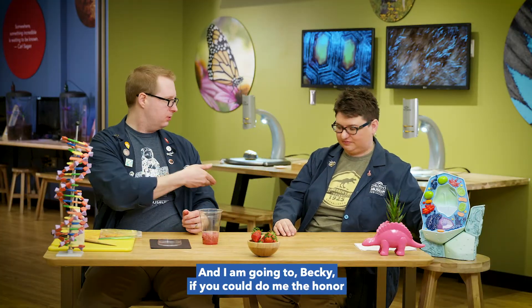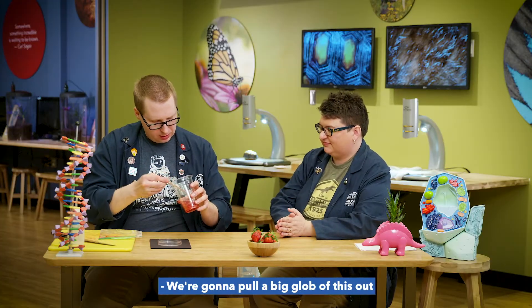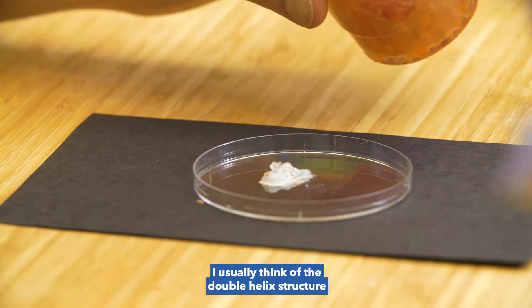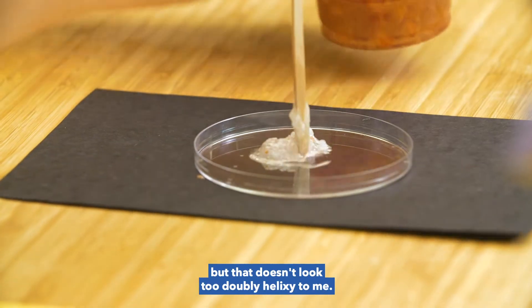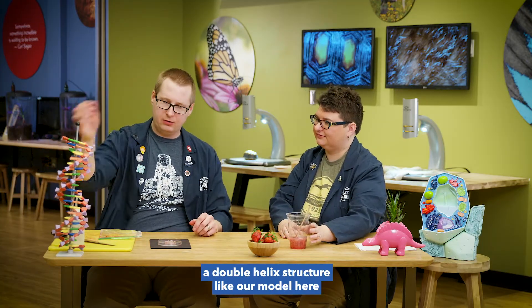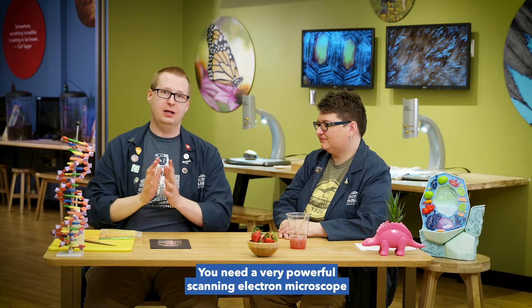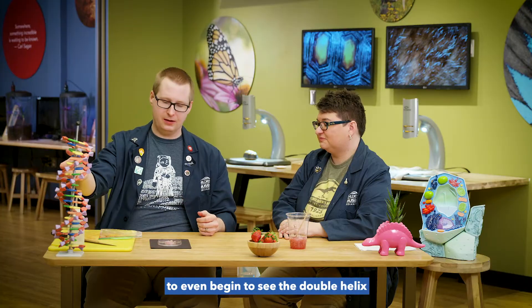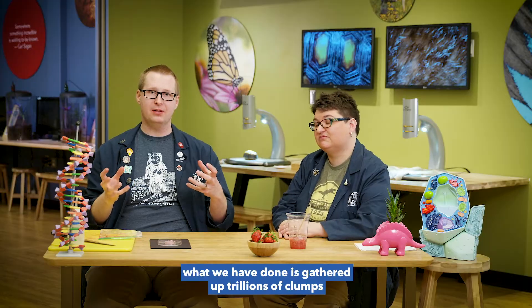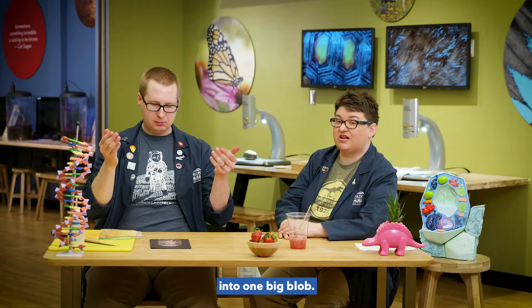We're going to pull a big glob of this out and deposit it on our Petri dish. Now when I think of DNA, I usually think of the double helix structure — but that doesn't look too double-helix-y to me. You're correct, Becky — DNA does have a double helix structure like our model here, but that's the microscopic level of DNA. You need a very powerful scanning electron microscope to even begin to see the double helix. Since we don't have one of those, what we have done is gathered up trillions of clumps of DNA, all piled and coiled on top of each other into one big blob.